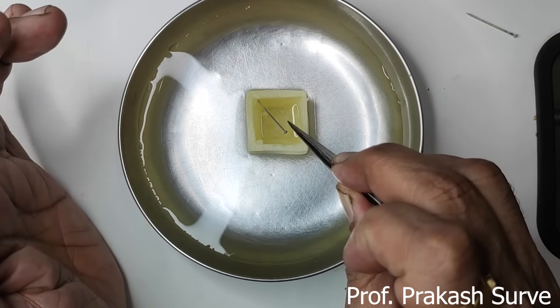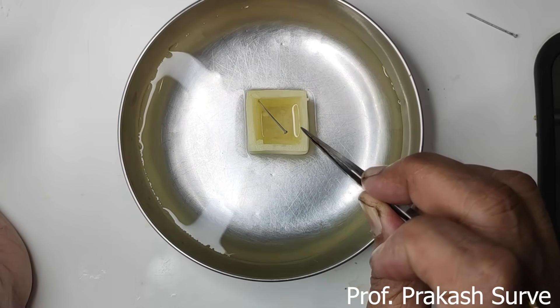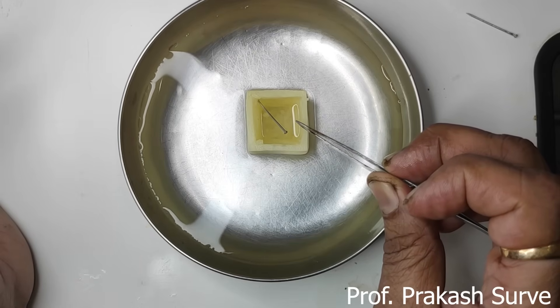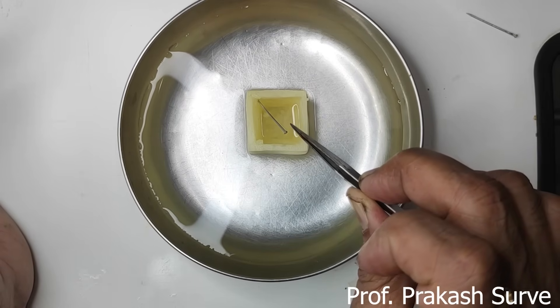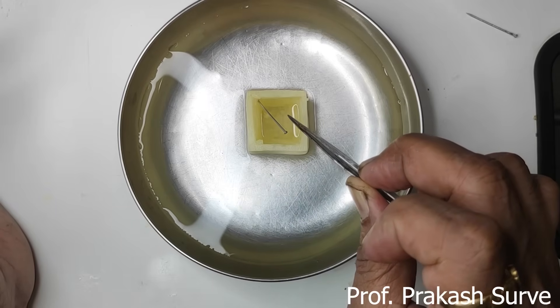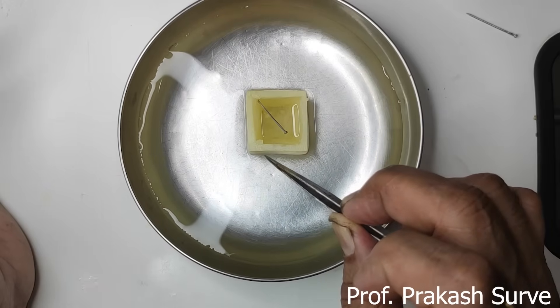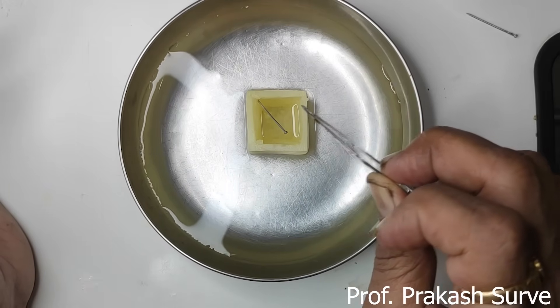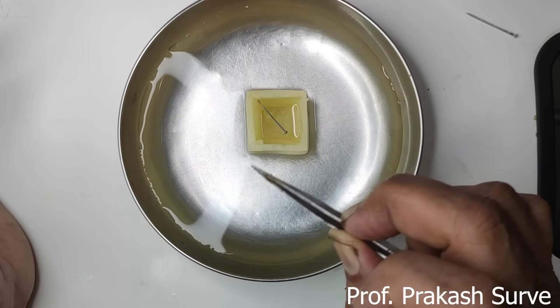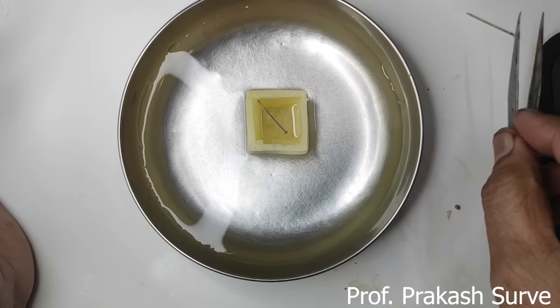Inside the osmoscope is the hypertonic solution. We will watch this after one hour. After one hour we can see the rise in the level of the salt solution inside, because water will travel from the low concentration outside to the high concentration of salt inside. Until it reaches equilibrium, sometimes we can observe overflow of the solution. This demonstrates osmosis taking place, which is called endosmosis.